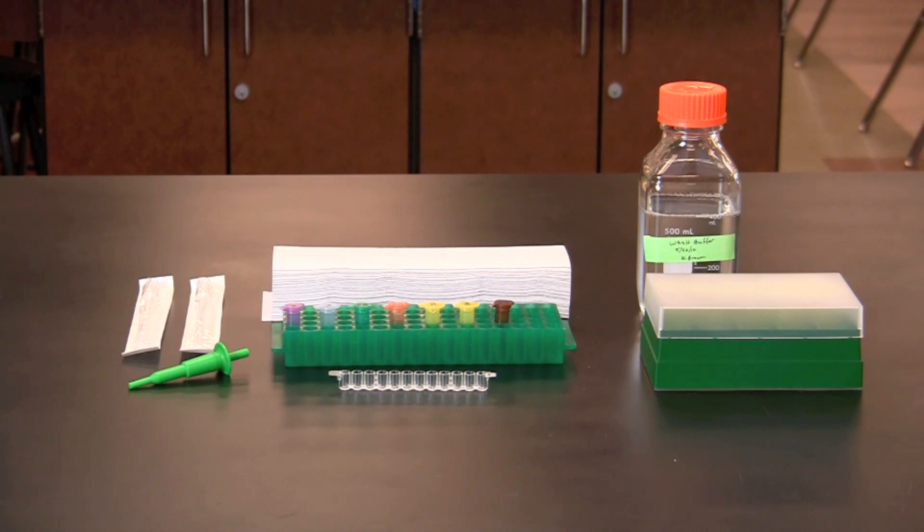In this video you will learn how to perform a qualitative ELISA, or enzyme-linked immunosorbent assay. The ELISA uses antibodies to detect an antigen or antibody of interest by exploiting the tendency of proteins to adsorb or stick to a plastic microplate. In this activity, an ELISA will be used to detect the presence or absence of an antibody.